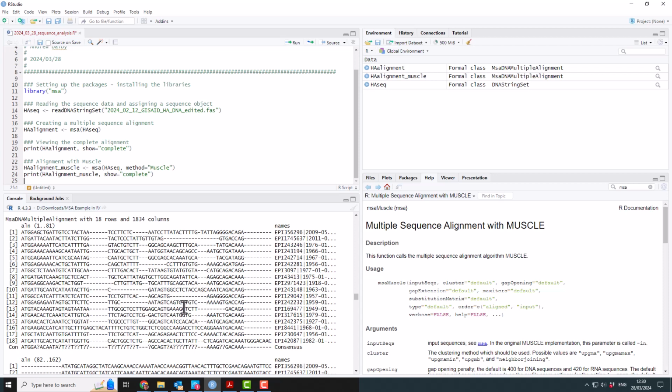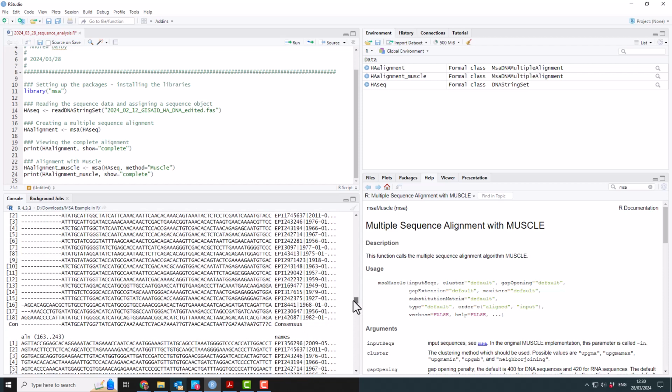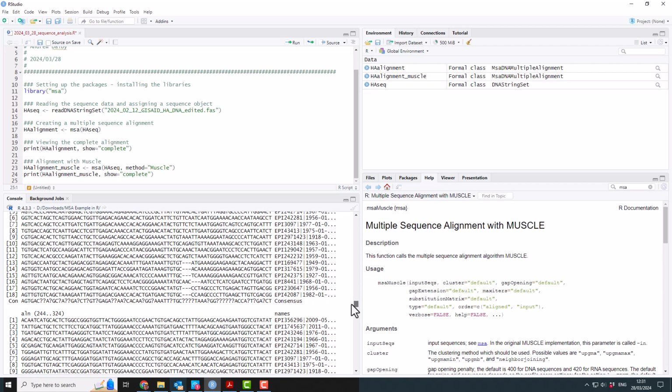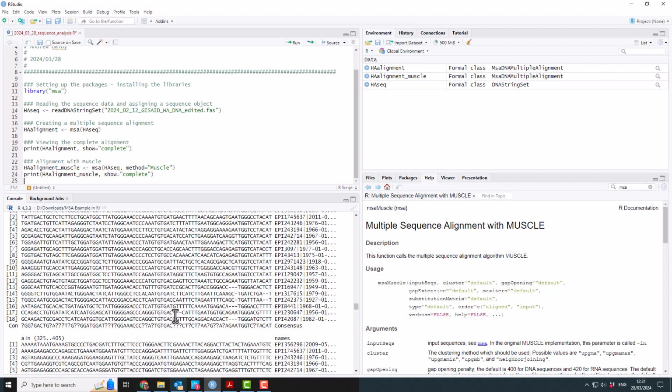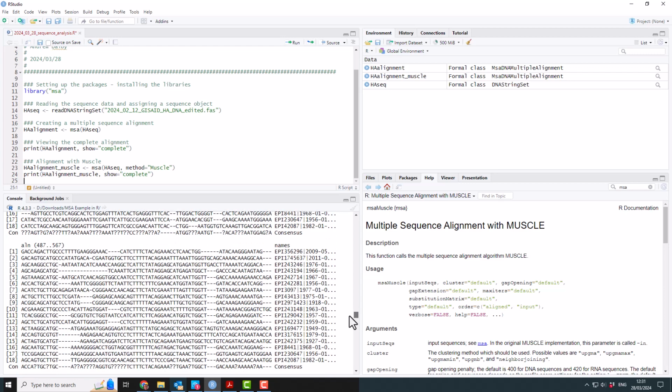If you end up with gaps and they are not a multiple of 3, then what you would do is change the codons. So you would change the codon alignment when you're translating from the DNA to the amino acid. So what you're looking for when you're looking at a DNA alignment is gaps which are 3, insertions which are 3, and to avoid ones which are 1 or 2. So 3, 6, 9, fine. Other ones, not so good.